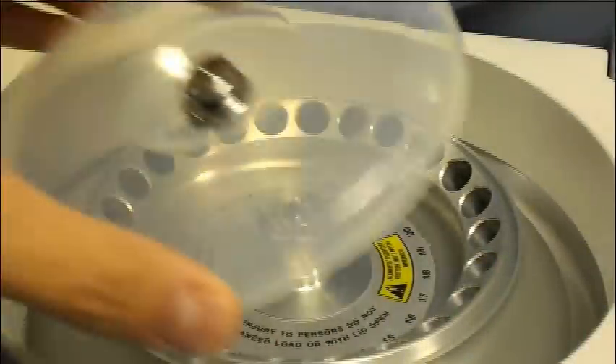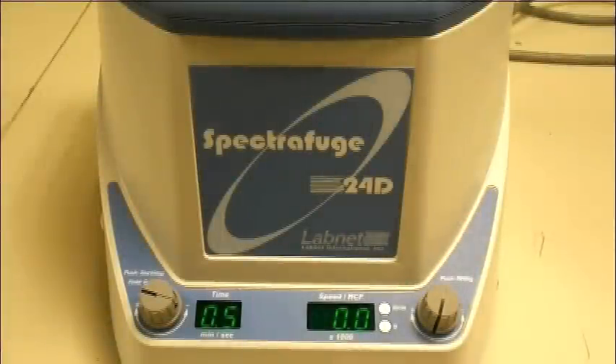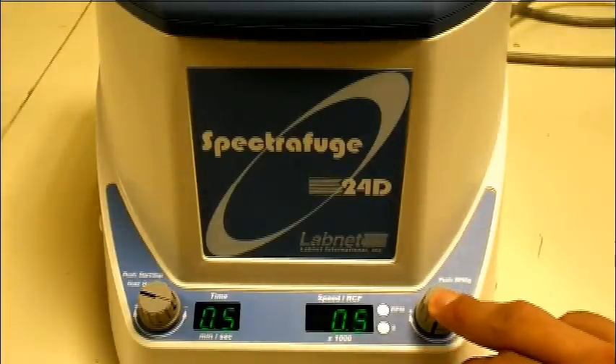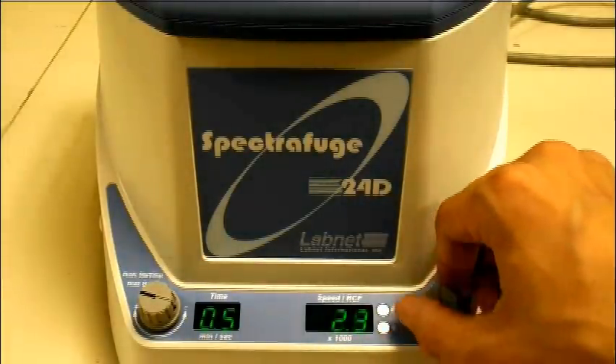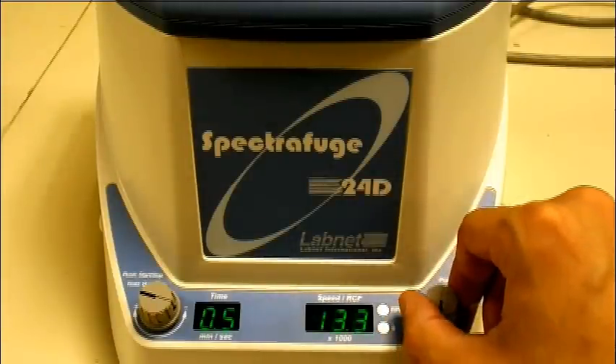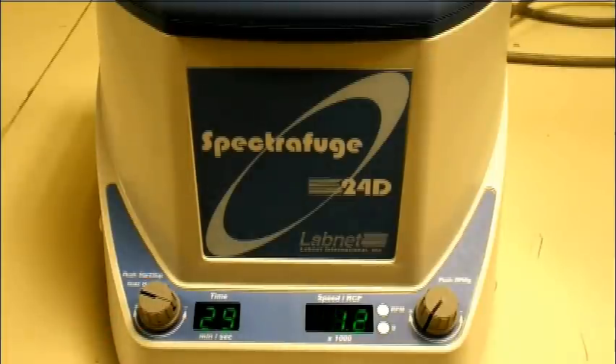Let's fire this puppy up and see how well it works. We're going to start by spinning it to its maximum RPM at a time of only 30 seconds. First, I'm going to push down on the knob to select RPM, and then select the RPM by twisting it clockwise all the way to — should read about 13.3. And there it goes. Now all I have to do is press this knob over here to the left and it'll actually start the process. You may or may not be able to hear that, but it is exceptionally quiet. And just like that, it's already at its maximum speed.